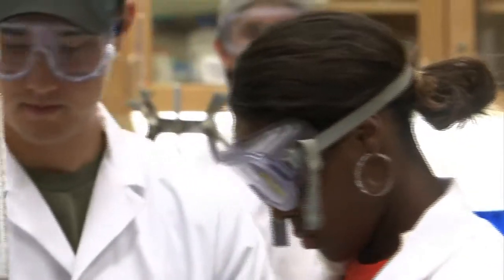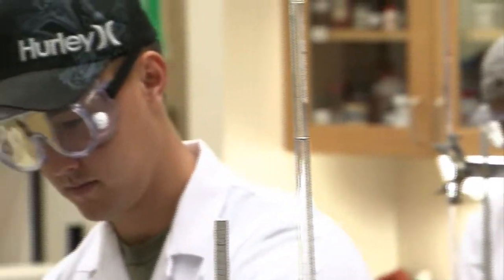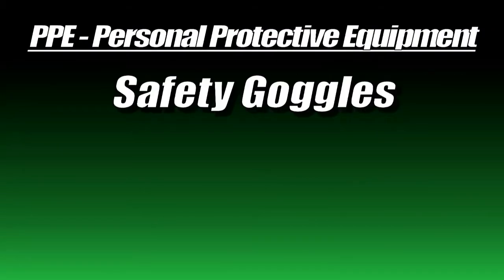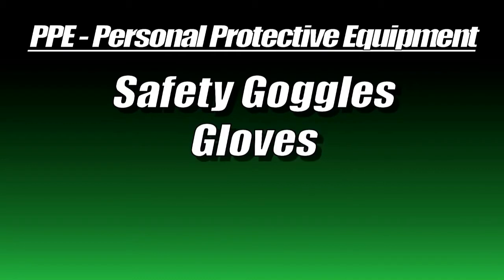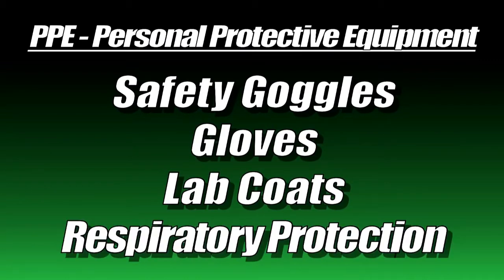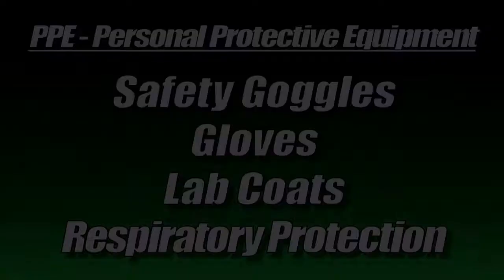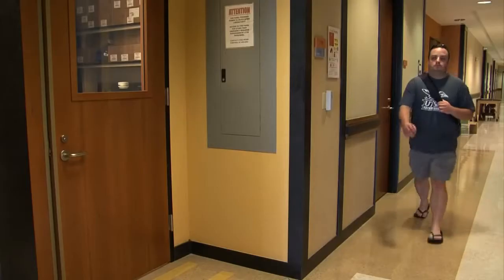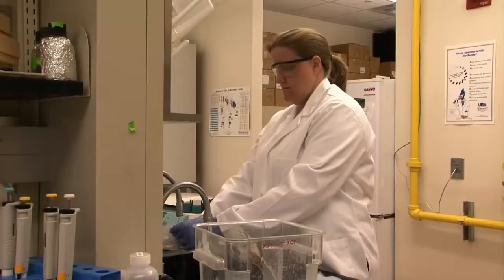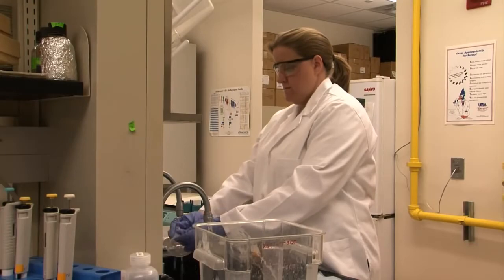Personal protective equipment, or PPE, is another key to protecting yourself. There are many types of PPE that should always be worn while working in the lab. They include safety goggles, gloves, lab coats, and perhaps respiratory protection if deemed necessary by the chemical in question. Most importantly, wearing shorts or sandals is not permitted in the lab. Your feet and legs must be completely covered at all times.